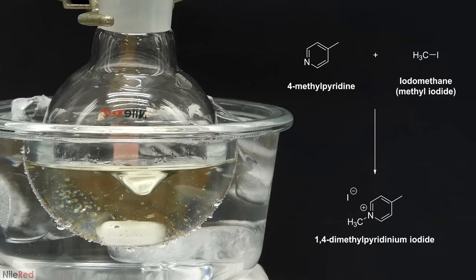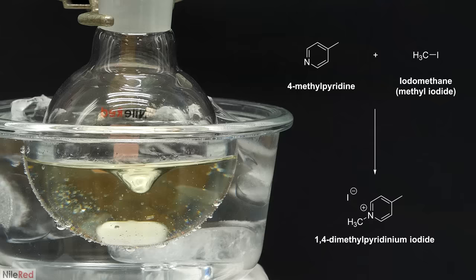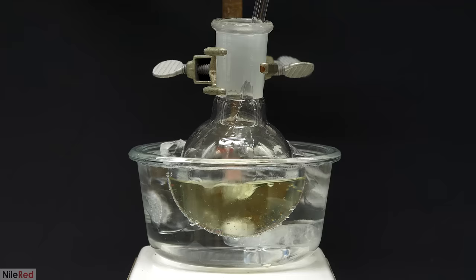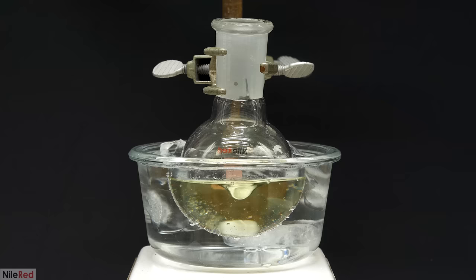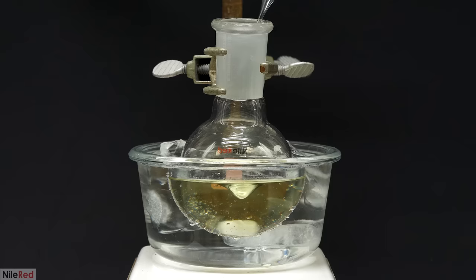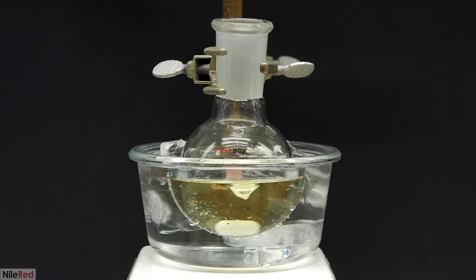With each addition, it didn't look like much was happening, but it was slowly getting more and more yellow. What was happening here was a relatively slow reaction between the 4-methylpyridine and the iodomethane. The major product of this is 1,4-dimethylpyridinium iodide, which has a slight yellow color. The reason I did this in an ice bath and added the iodomethane slowly was just to keep things under control. When the iodomethane's added, it can generate some heat, and if this was all done at room temperature, it might have heated things up a bit too much.